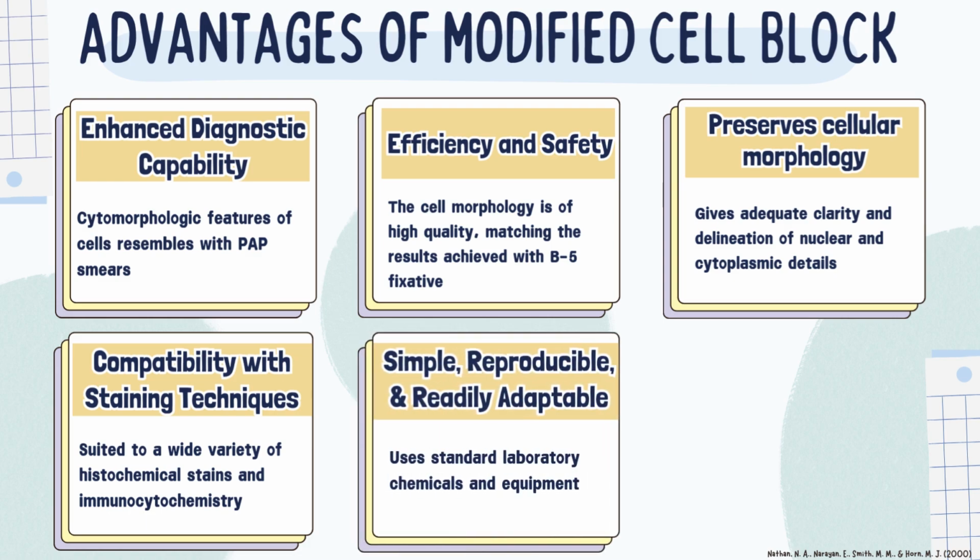Fifth, simple, reproducible, and readily adaptable. The method uses standard laboratory chemicals and equipment, making it accessible for most pathology labs. It is reproducible as the cell block can be used for various purposes.